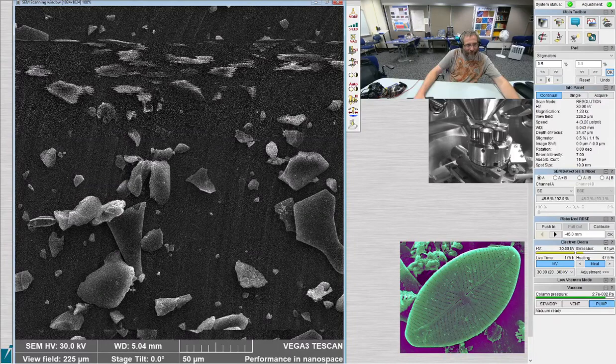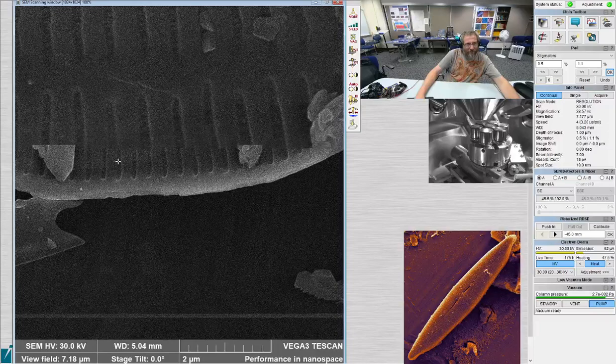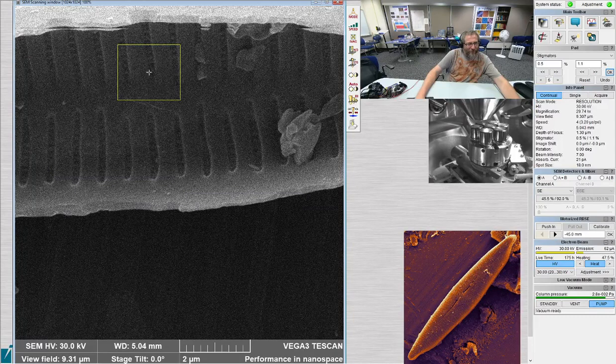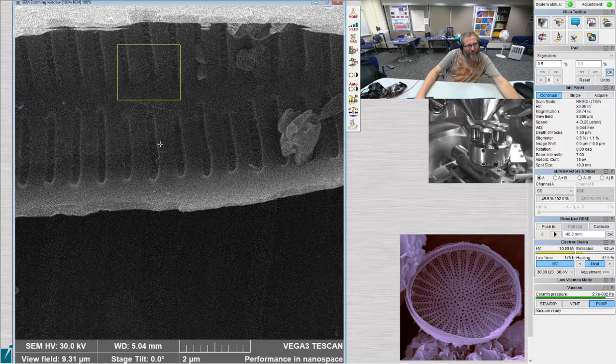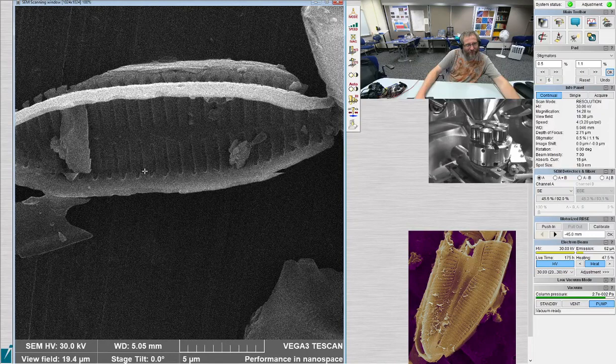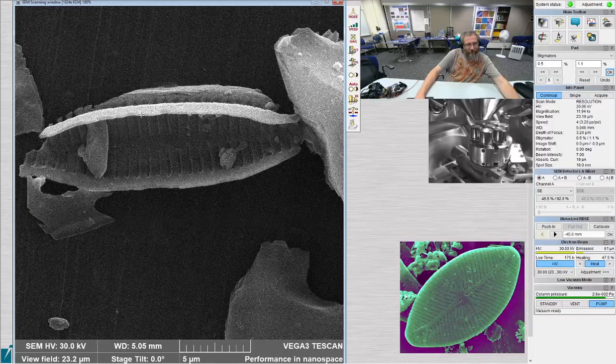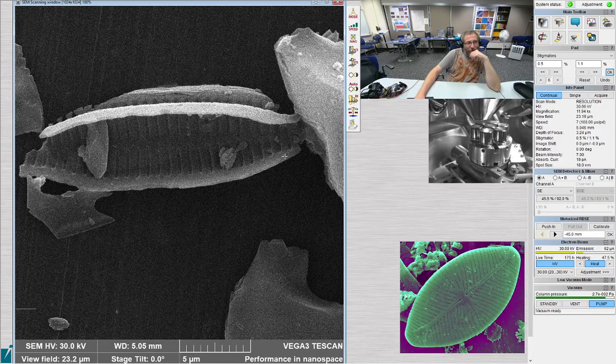What is this? Ugh, what is this? I thought that would resolve itself into an answer for me, but it hasn't. Huh. Like a tiny ulnaria. Like the world's shortest ulnaria. We need to get ourselves a Fragilaria expert on the team so that we don't have to deal with this crap. Yeah, that's not me.